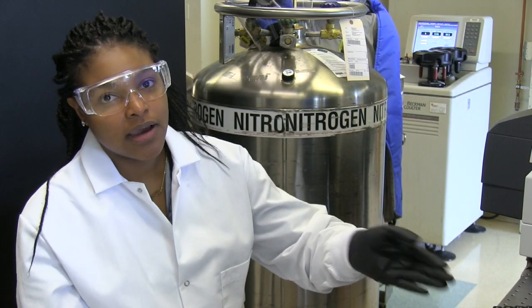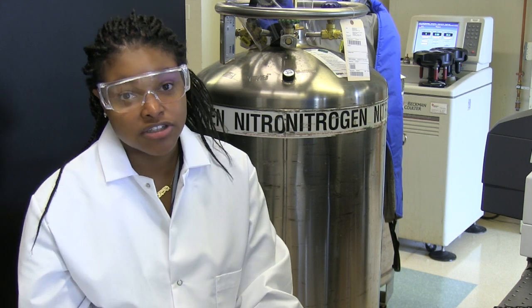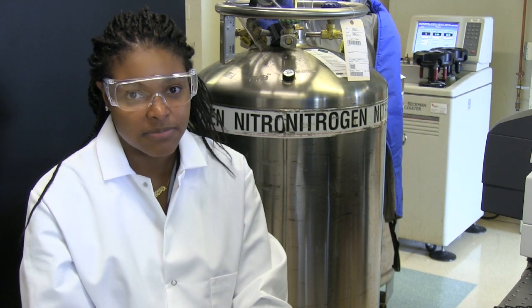After we do the absorption spectroscopy, we take the sensors and we measure the fluorescence and how it responds to the hydrogen peroxide and the nitric oxide. And that's one thing that I'm learning this summer, how to use the fluorescence spectroscopy machine. I'm going to be making a 3D tumor model, which is really cool too.